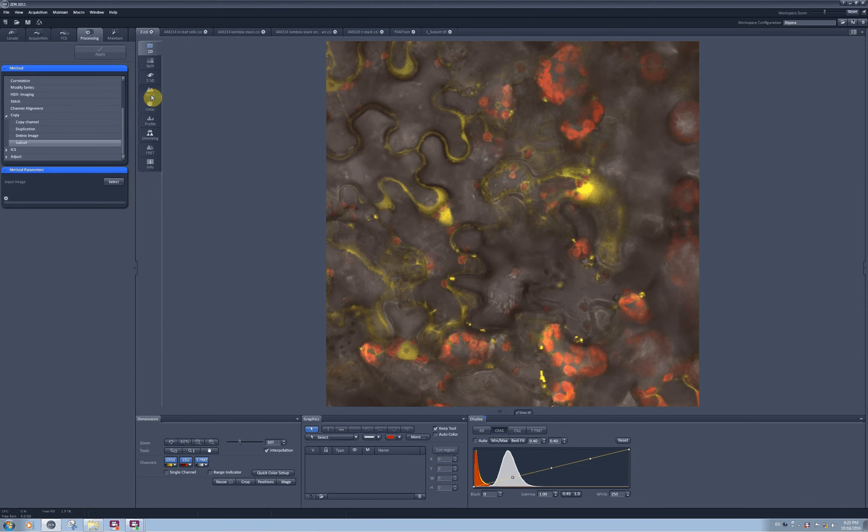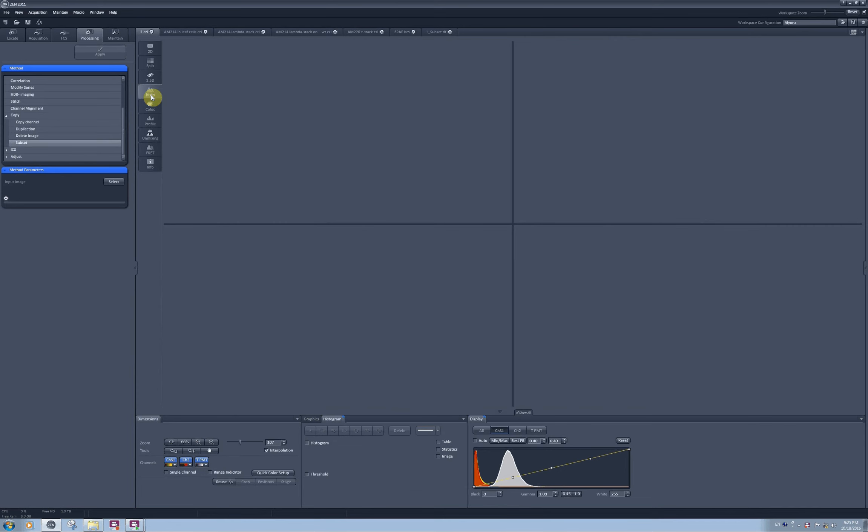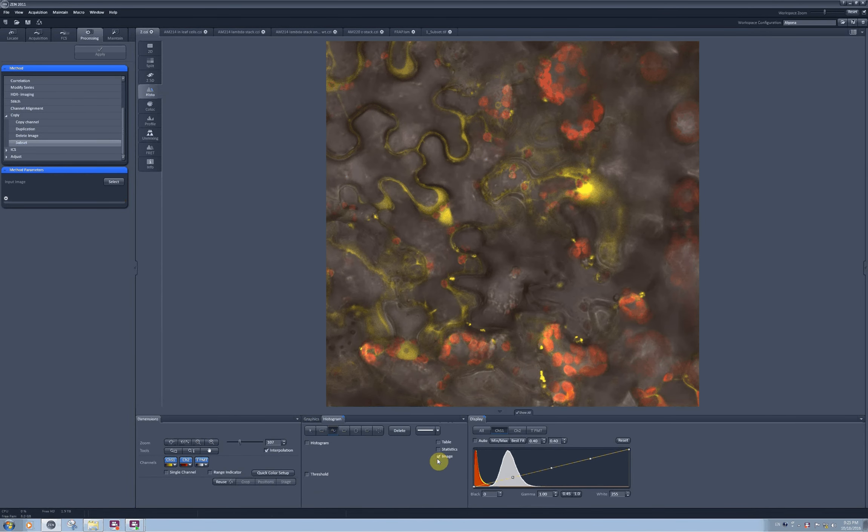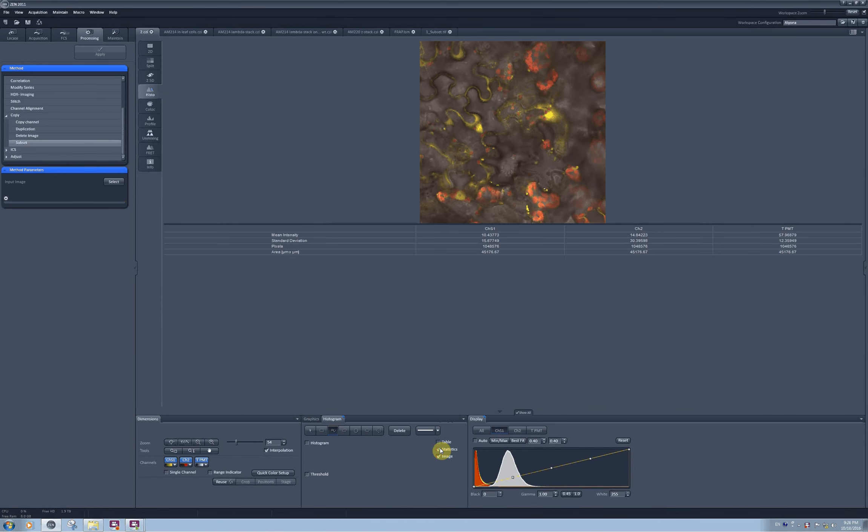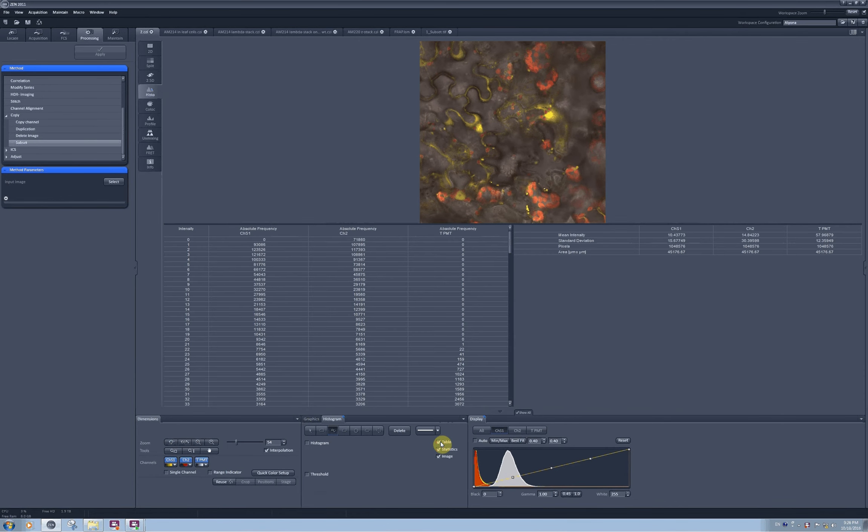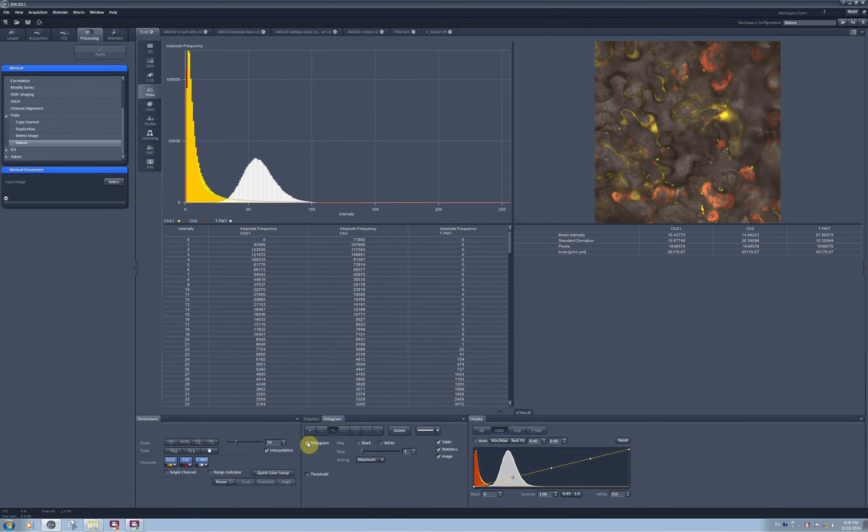In the Histo tab you can quantify intensities in the regions of interest on your image. You need to activate the check boxes to see the image, to see the statistics, and the table with the raw data. You can also check this box if you would like to see the histogram.